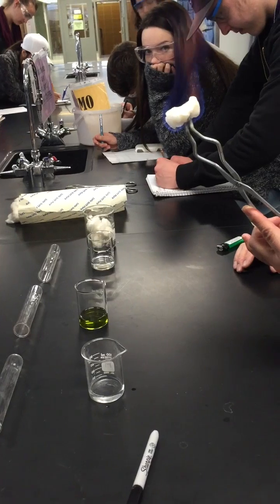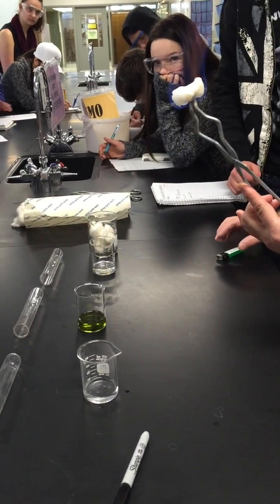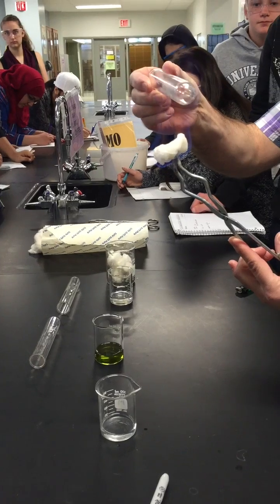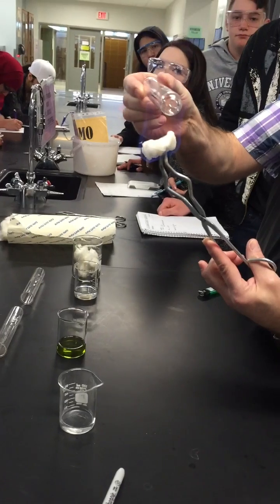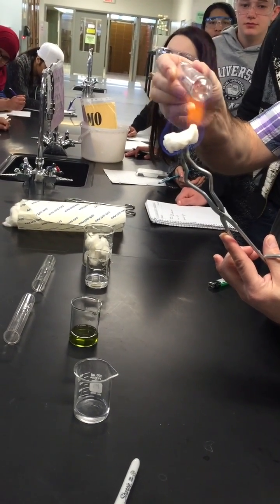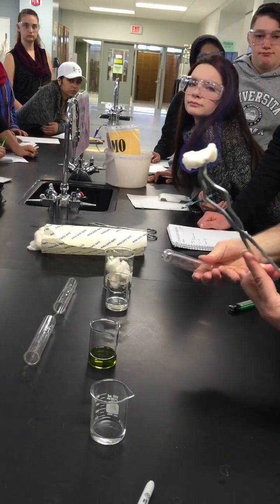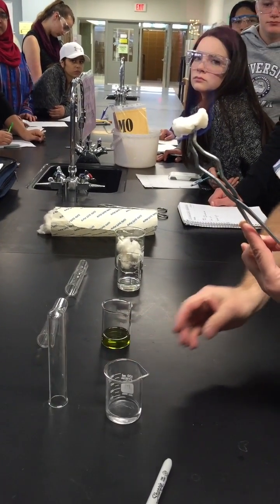Would anybody like to hold this? I won't let you use the tongs. So now what we'll do is we'll put this in the flame, and if this is a more pure burn, more complete combustion, we shouldn't see any soot on it. Do you see any soot? It's just dirty — it's dirty from before.